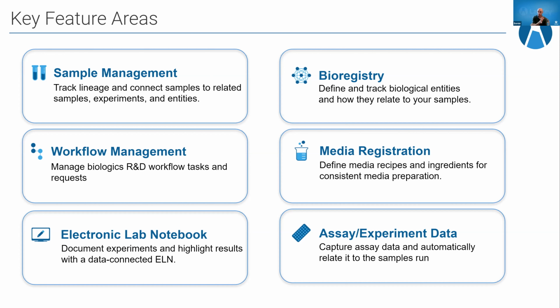So if there are certain facets of our products that are of value to you, and others that are not, it's an almost sure thing that one of our products contains what you want and excludes the things you don't currently need. And as your science develops, as your number of people and the complexity of your operations grow and you need those other things, we allow you to seamlessly upgrade through those tiers, making it really easy to scale.